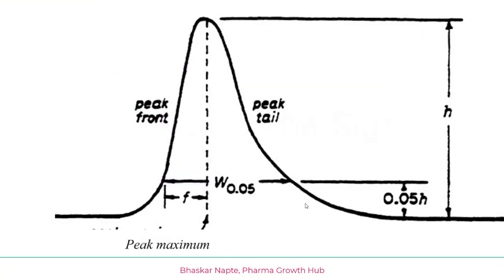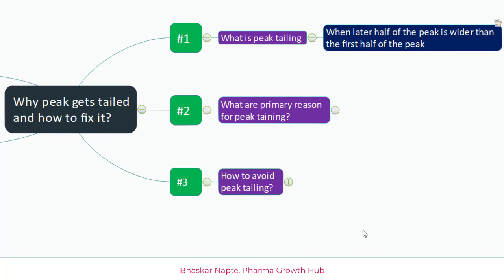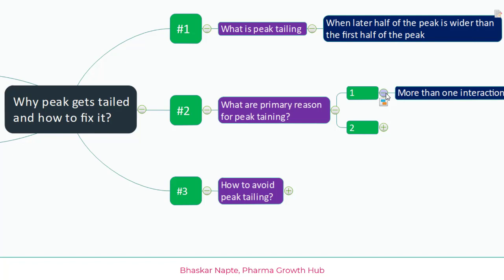Let me show you with a simple example. Here is the peak tailing example — in this case the latter half of the peak has a bigger width compared to the first half. So how do we understand peak tailing and what are the primary reasons for getting a peak tail?